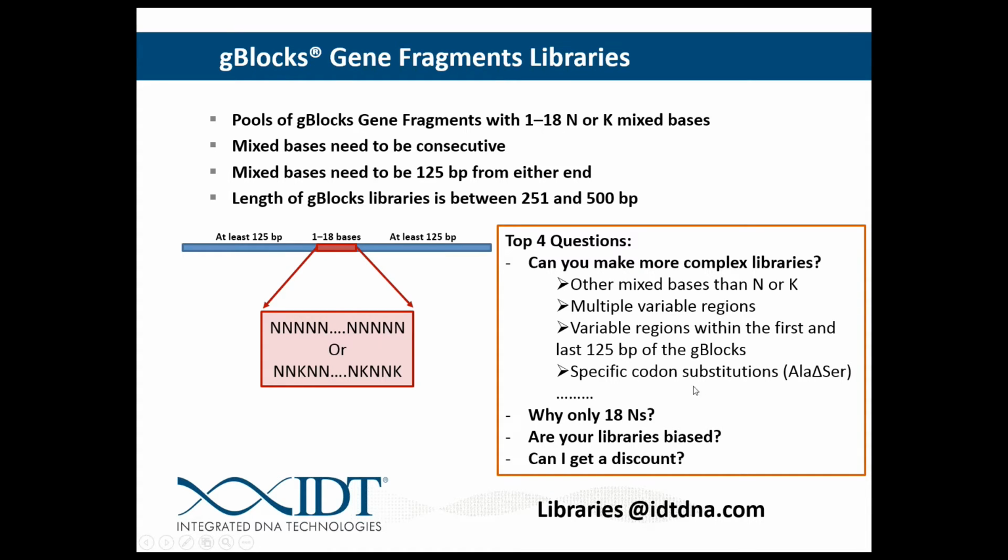With specific codon substitutions, we don't have technology that is robust enough currently to allow something like that to work. So that sums up the questions about the complexity of libraries. If I haven't covered anything that you have a question about, please do email us at libraries@idtdna.com.